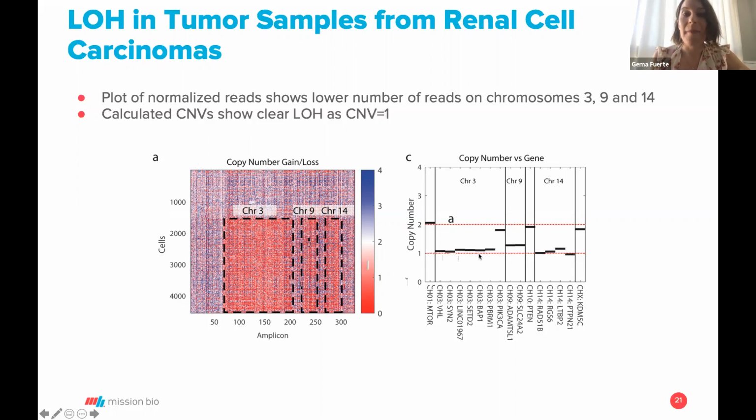Again, this is not the only thing we provide, because we provide you the genotype in addition to the copy number, and we will see it when I show you the multi-omics analysis.